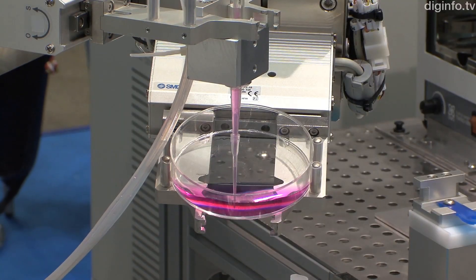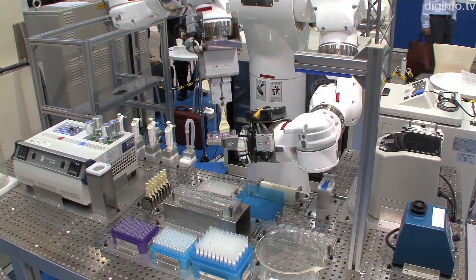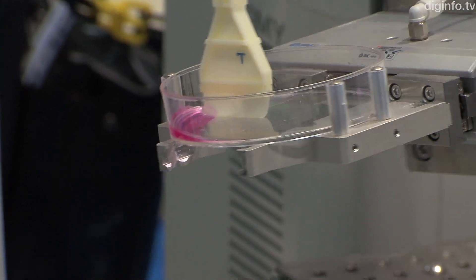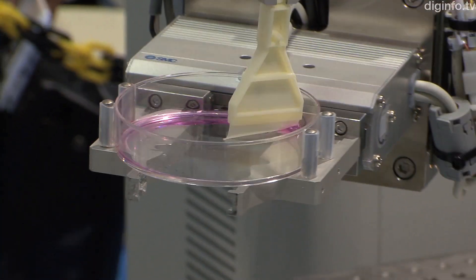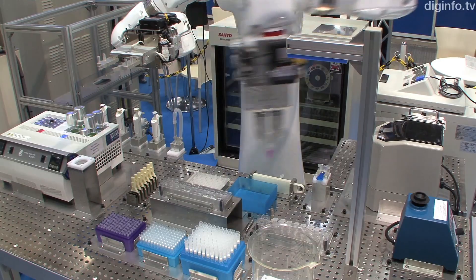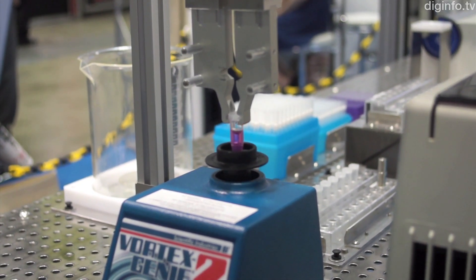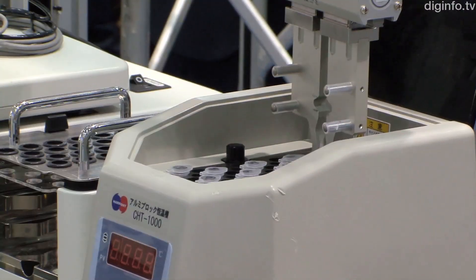Mahoro, co-developed by Iced and Yasukawa, is a general-purpose android for automating lab work that previously had to be done manually. The robot can do tasks such as dispensing and culturing faster and more precisely than people, so it can do clinical tests and work with biohazards efficiently.